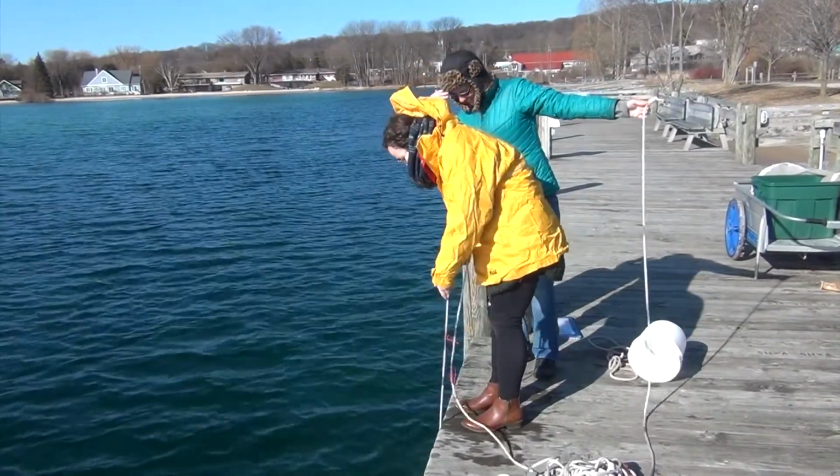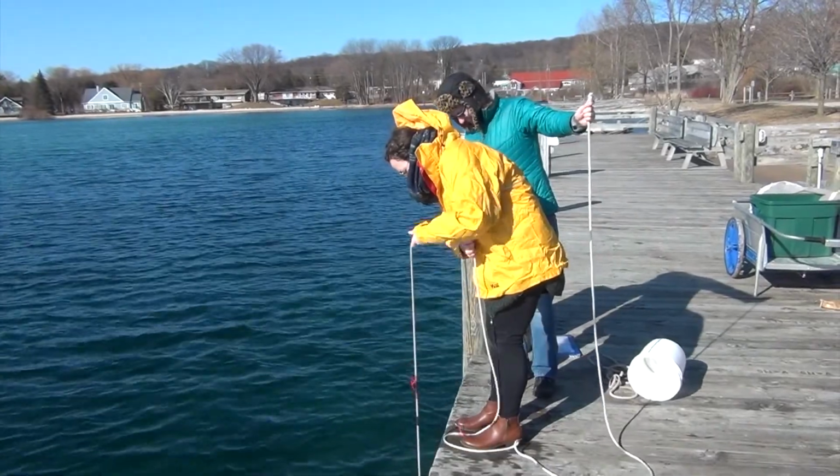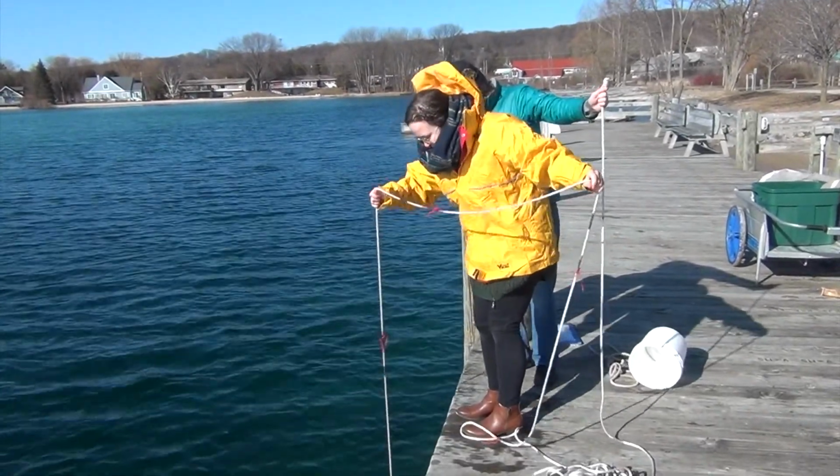Once you can no longer see the disc, pull it back up and count the meter marks as they come out of the water to ensure that you have the correct measurements.